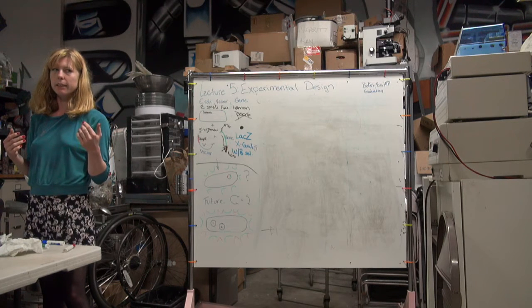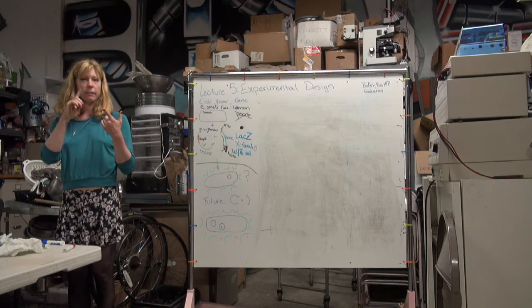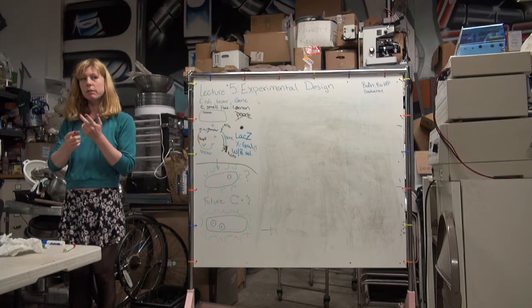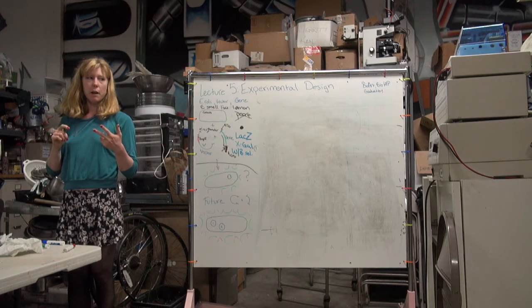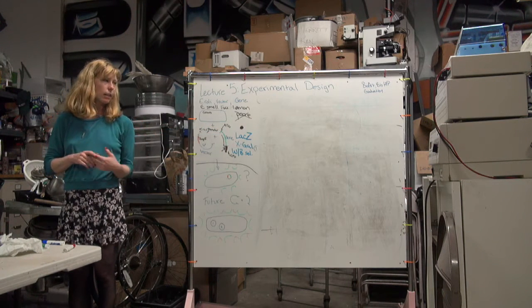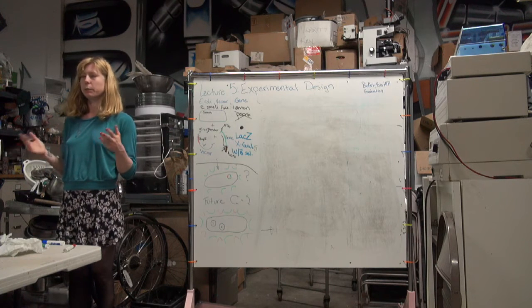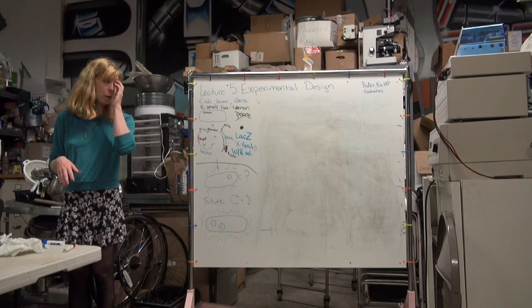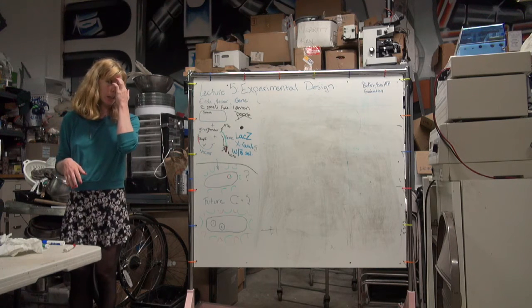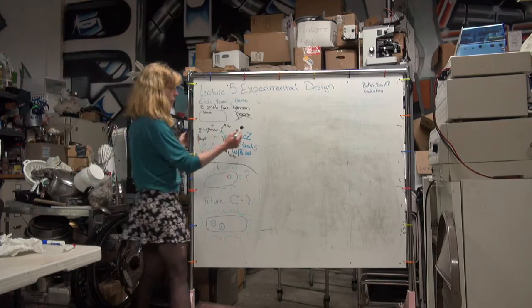Yes, you could. And there are two ways you could do it. One, just simply cutting it out with some enzymes. You could also interrupt it like we did the LacZ. You could also, now that you know your gene works, put it in a different plasmid. You could also use PCR or some other method. PCR would work like this.